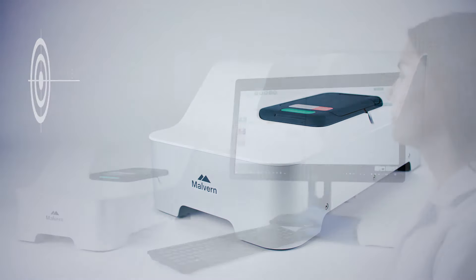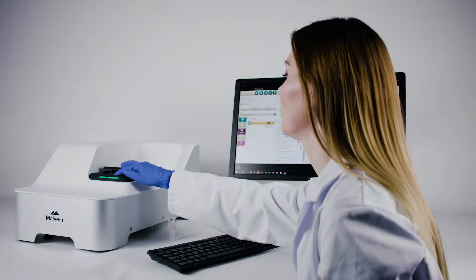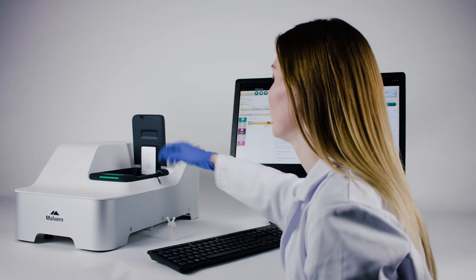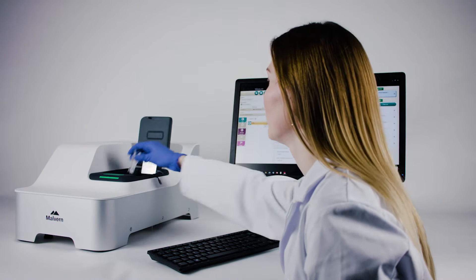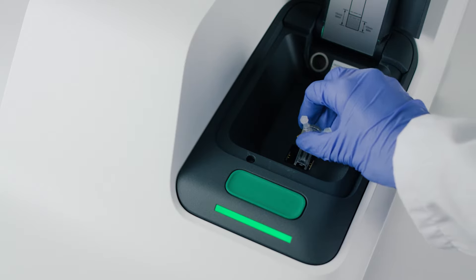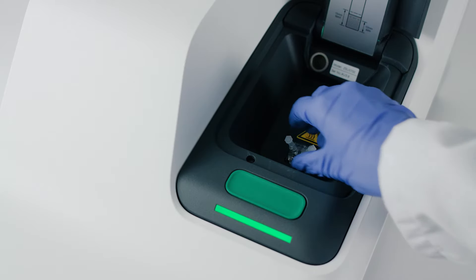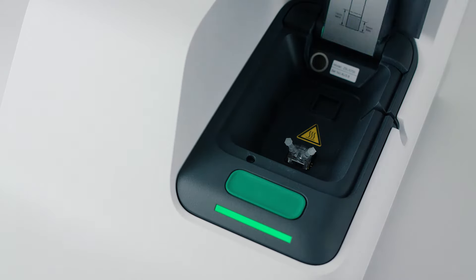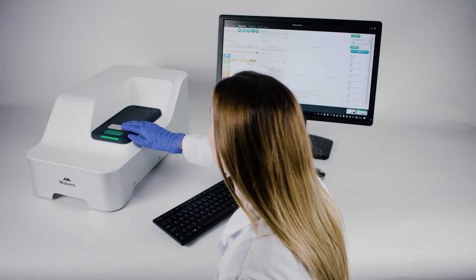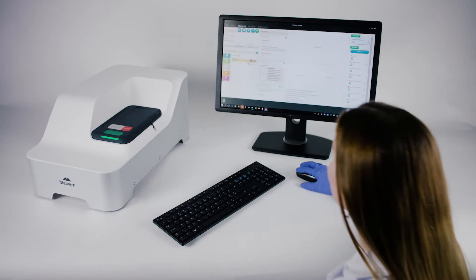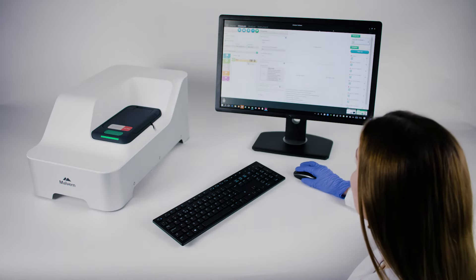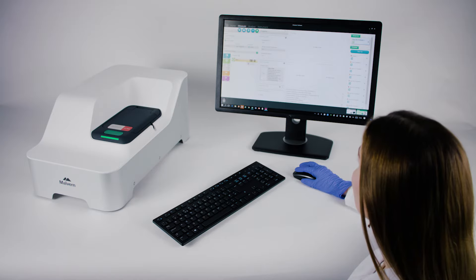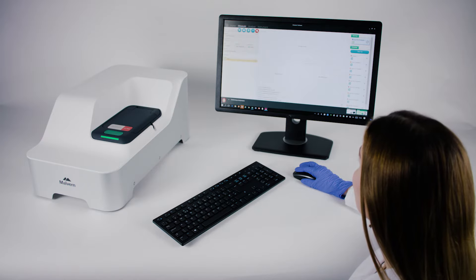Building on the strengths of the ZetaSizer Nano, the new platform combines unique measurement features, hardware capabilities, and software intelligence to enable novel, meaningful, and robust data to be acquired quickly and easily.